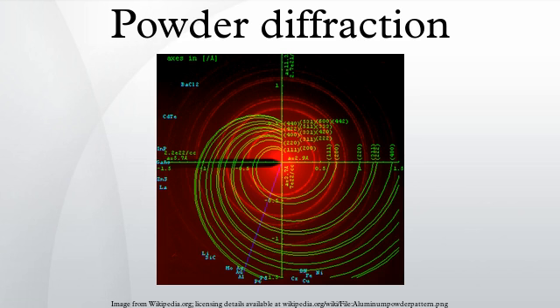X-ray tubes. Laboratory X-ray diffraction equipment relies on the use of an X-ray tube, which is used to produce the X-rays. For more on how X-ray tubes work, see for example here or X-ray. The most commonly used laboratory X-ray tube uses a copper anode, but cobalt and molybdenum are also popular. The wavelength in nm varies for each source. The table below shows these wavelengths, determined by Bearden and quoted in the International Tables for X-ray Crystallography. According to the last re-examination of Holzer et al., these values are respectively.